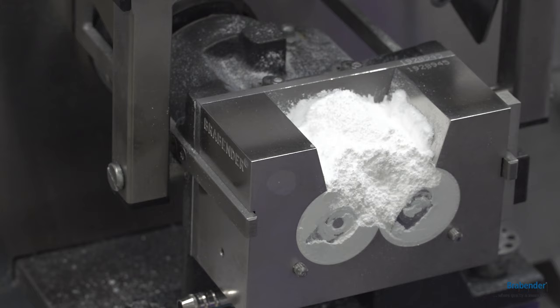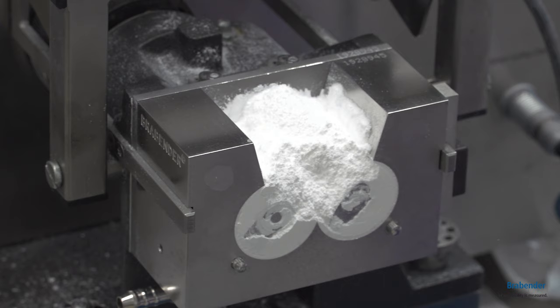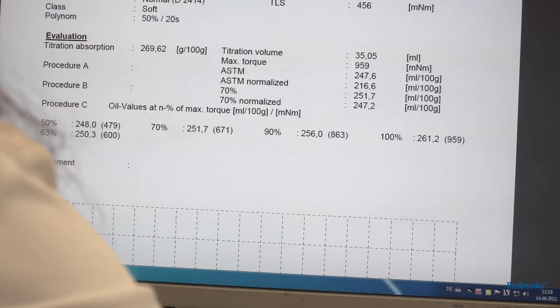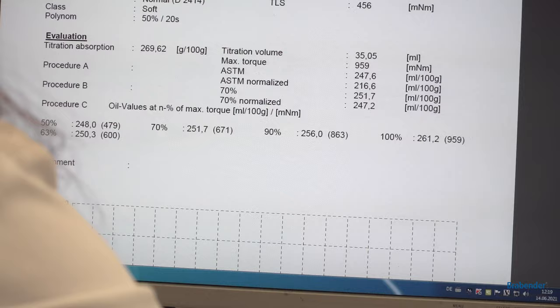The burette is a precision metering pump. The burette is used to add a certain amount of oil to the material being processed. The process increases the torque required for the kneading process.